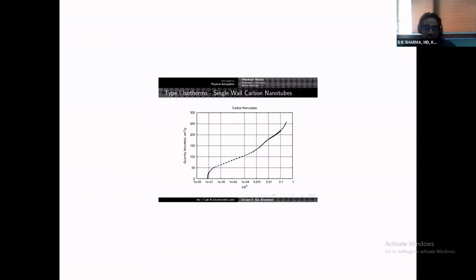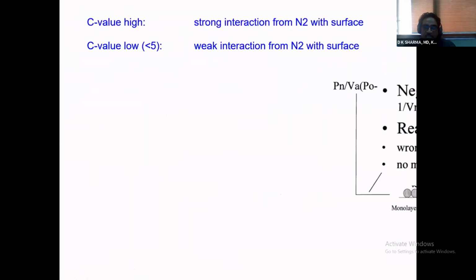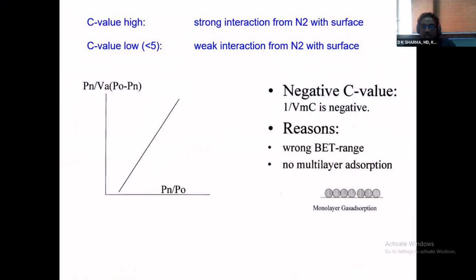It runs from just before the monolayer is complete, right up to the point where it has already formed a few multi-layers. But in some cases, no matter what juggling you do with the points, whether you shift points into the calculation or take them out, you will never get a positive C value. In such cases you really can't calculate the BET surface area using that data.